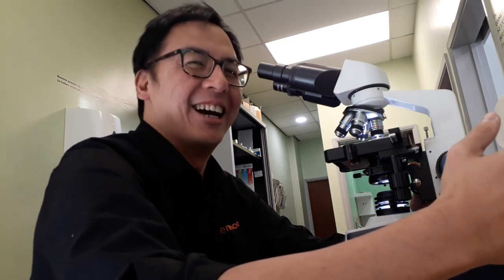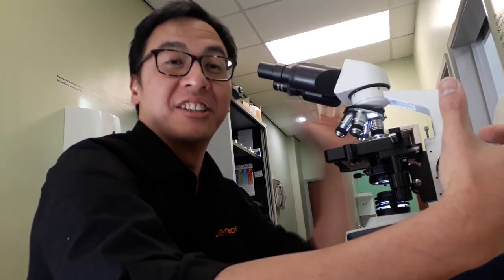Hi, this is a microscope. It's a very cool microscope with cool LED lights and I love it. I'm going to explain to you why I believe this is such an important tool when you tell me your dog is shaking his head or scratching his ears.